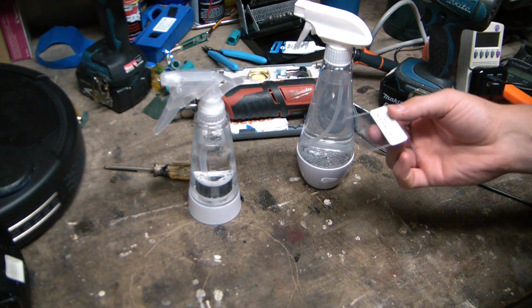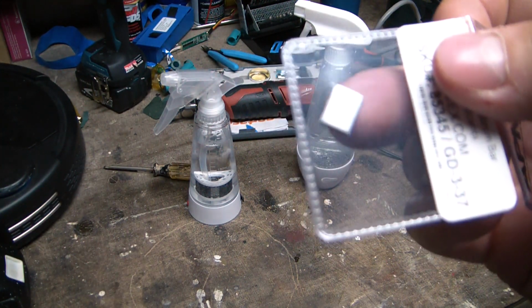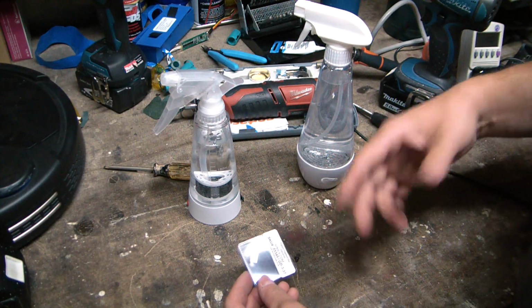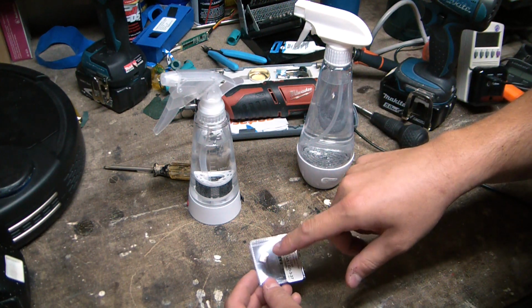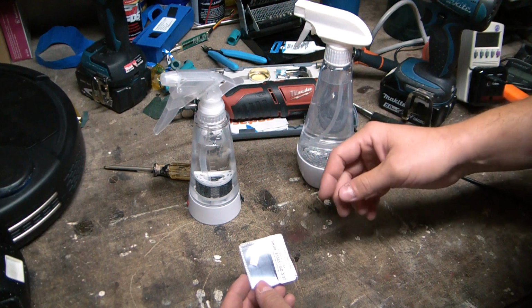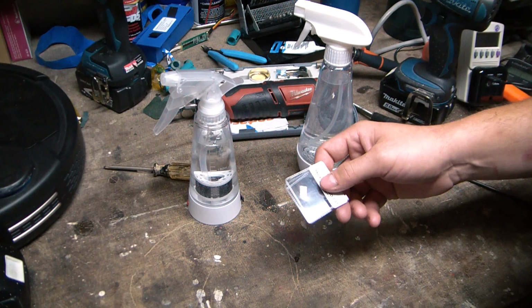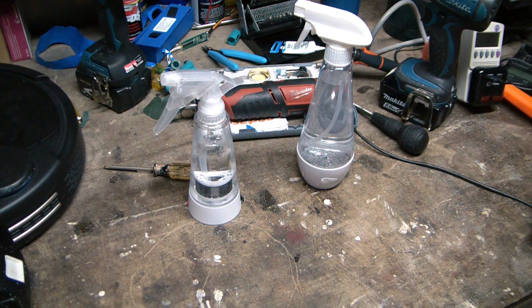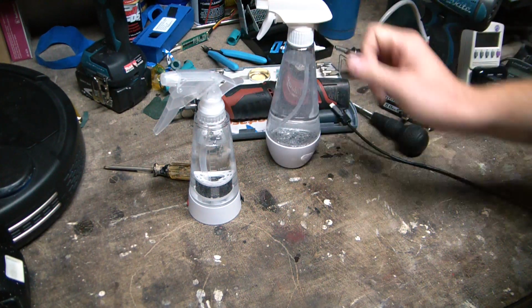Also, one thing I have been wanting to try is platinum anodes to actually produce perchlorates. Now, a patron actually did send me a beautiful platinized titanium anode that I still haven't started playing around with, but I actually want to try also making my own through a little platinum chemistry. Now, platinum chemistry is pretty nasty stuff, actually. If you get platinum salts on your skin, you become pretty rapidly sensitized to it, so you really got to be careful when working with platinum.